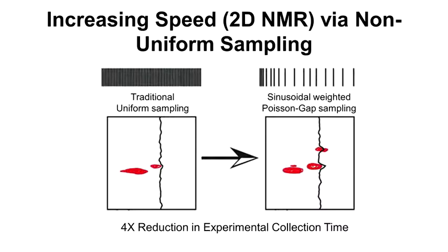This is something that's been going on, especially in the field of protein work, where you have only partial sampling along the 2D spectrum. But there are groups that are looking at just doing partial sampling along a 1D spectrum. And there's mathematical evidence that non-uniform sampling improves the signal-to-noise in the signal. So whether it's for 2D, 3D, or even 1D, it is possible to get a signal enhancement using non-uniform sampling.